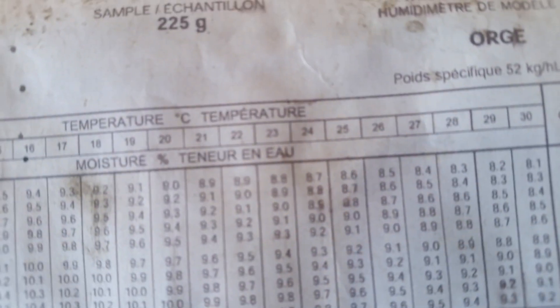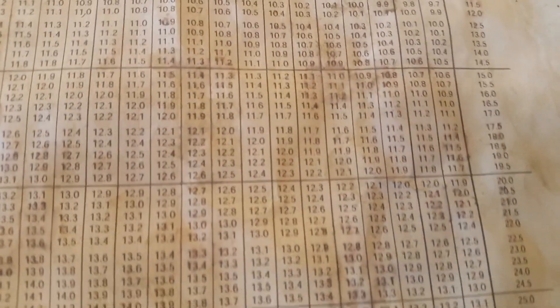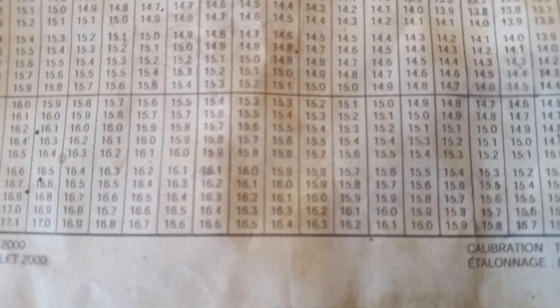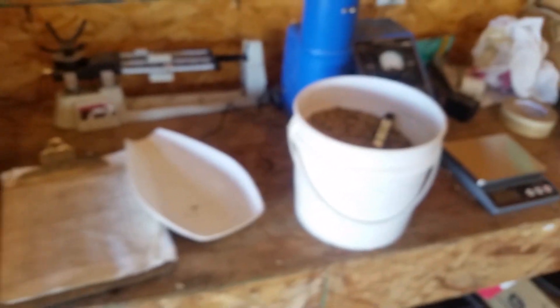The dial reads about 31, 32, 33 — so let's call it 33. Then you grab your chart. Look at the temperature: it's 24 degrees. You find 24 on the chart, then go down to where the dial reading was — 33. Find 33 and 24 on the chart — that gives you 15.6% moisture. You can see it right there.